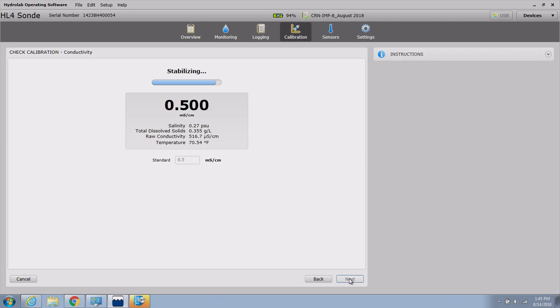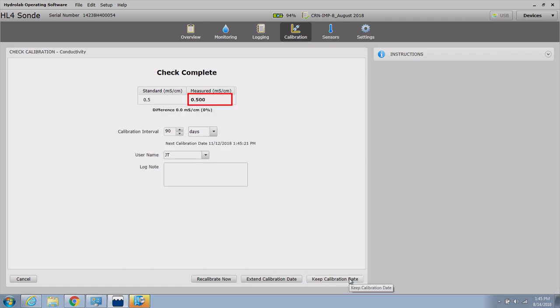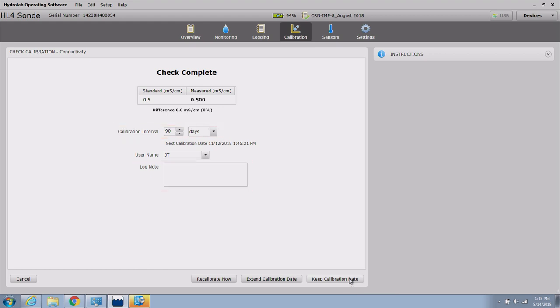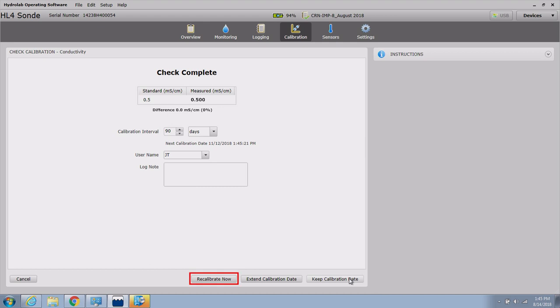When the calibration check is finished, you will see the measured value as well as the percentage of difference from the known standard value. The user can adjust the calibration interval or add a log note. When the desired settings have been changed, the user may choose to keep the calibration date, extend the calibration date, recalibrate now, or cancel the check.